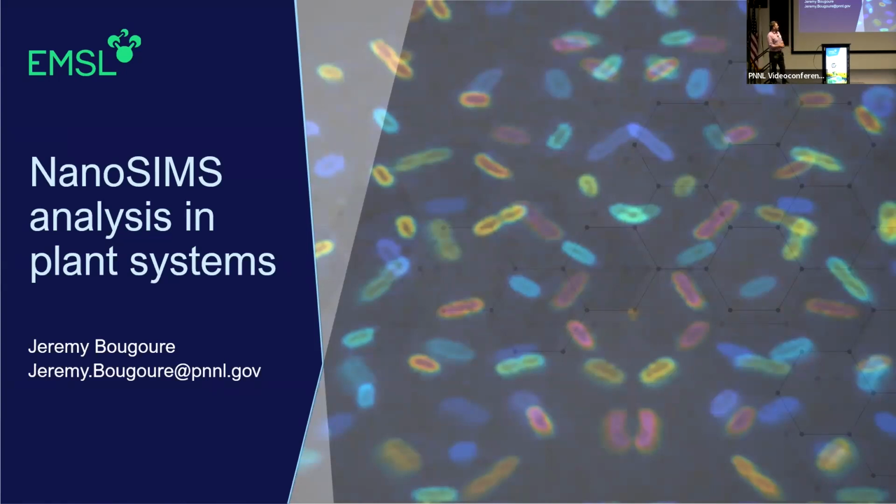So today I'm just going to give you a quick introduction on what NanoSIMS is and isn't, because it's a question that I see a lot when I sit in user meetings. So I thought I'd try and dispel some of the myths, and then just go through a couple of applications that we've used it on in plant systems.